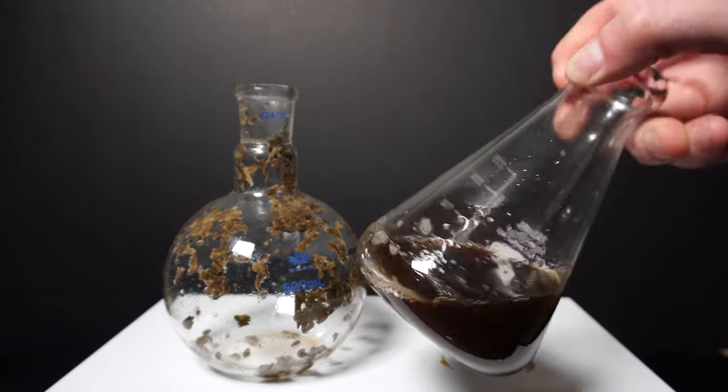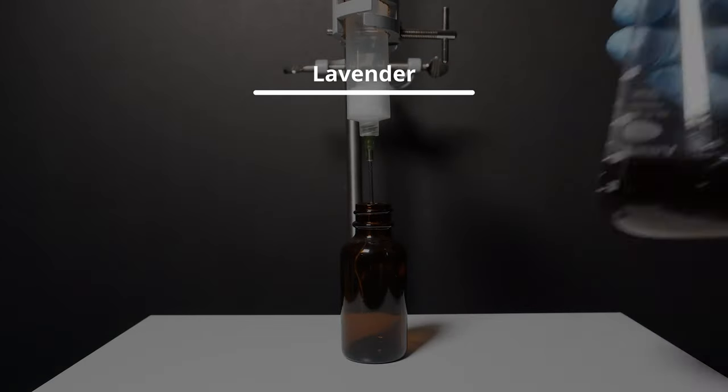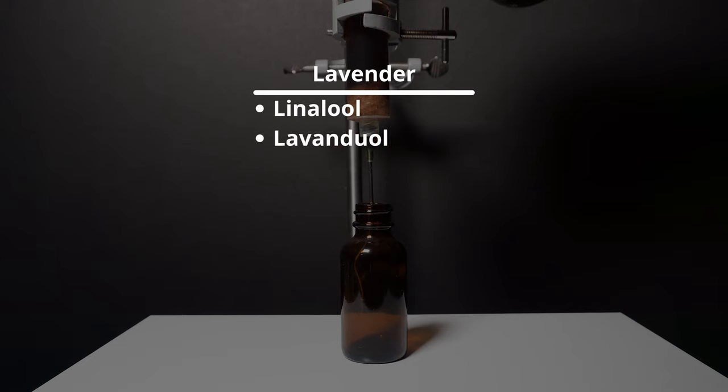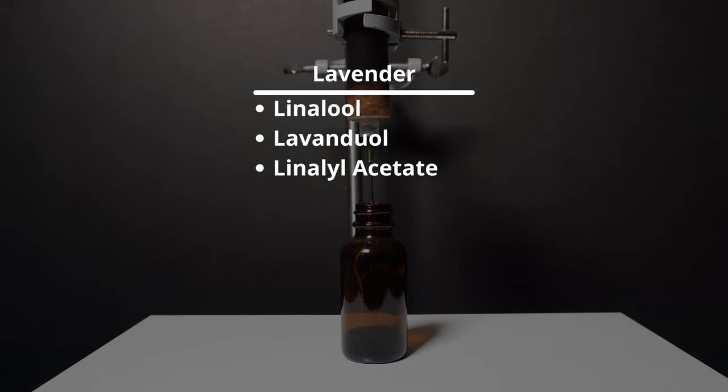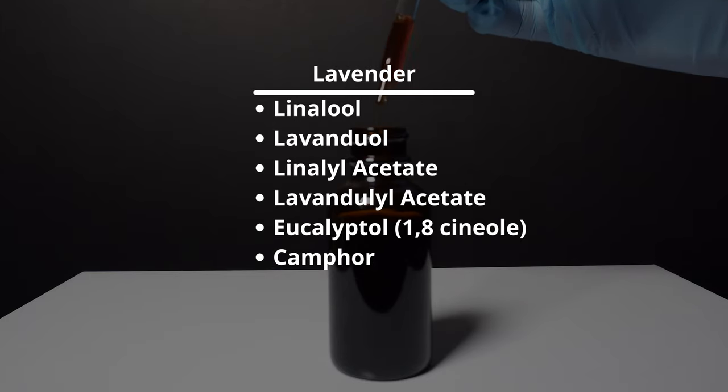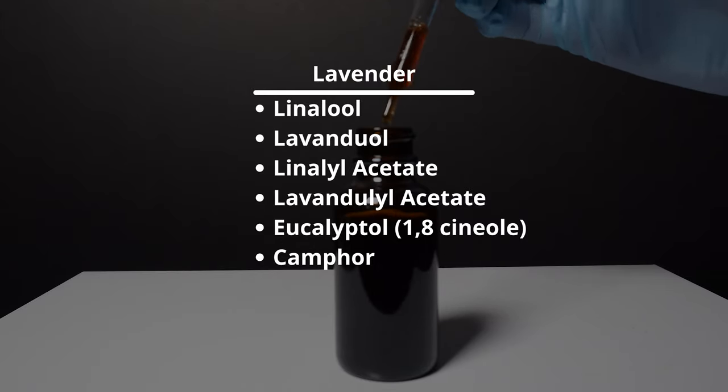Lavender oils contain a variety of different compounds that combine together to create the smell that we associate with lavender. Some of the compounds are linalool, lavandulol, linalyl acetate, lavandulyl acetate, eucalyptol, and camphor oil. Ideally we will have a mixture of all of these oils at the end of our process. So let's get started.